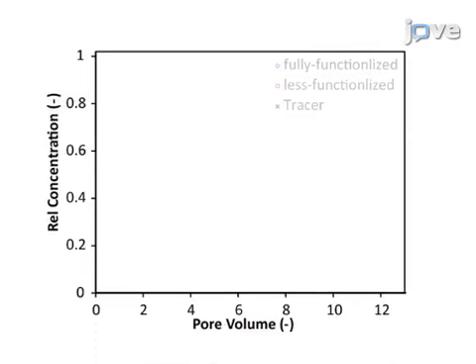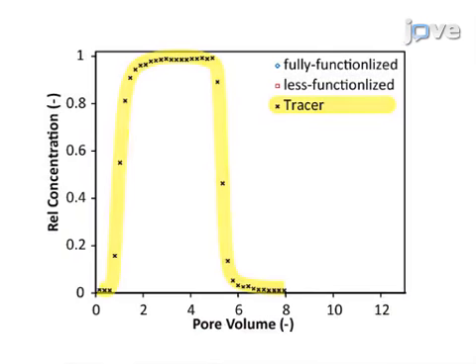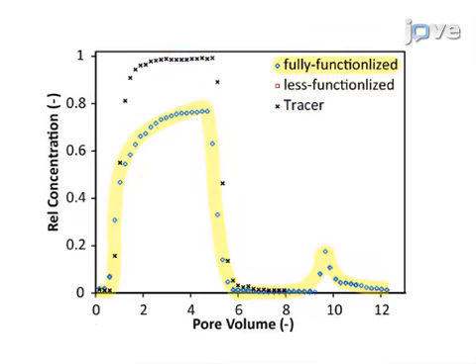The results show that the functionalization process has a large impact on the overall retention of multi-wall carbon nanotubes in the selected sand types. The demonstration of this method provides a guideline for surface modification of carbon nanotubes and an understanding of the impact of transport and retention of these nanoparticles in soil pores.